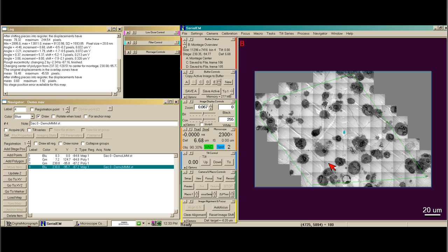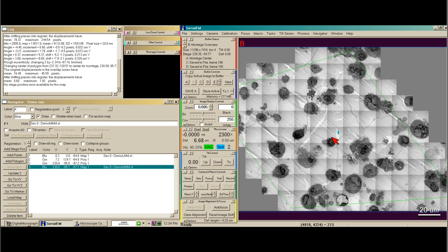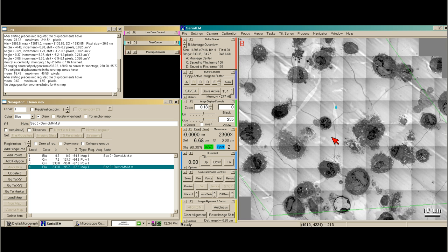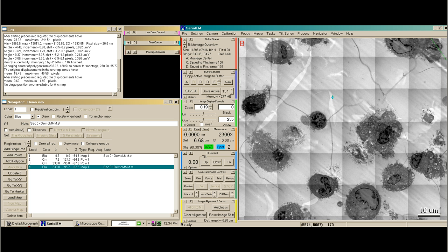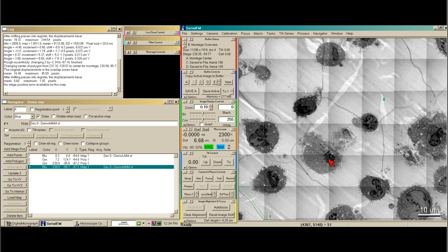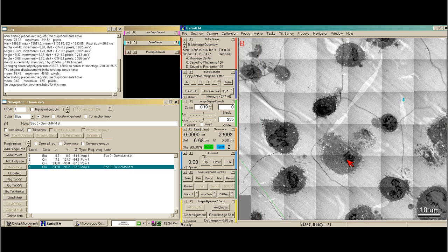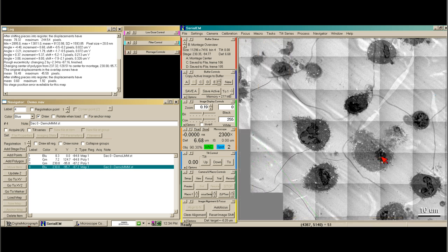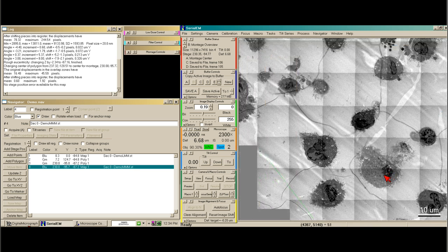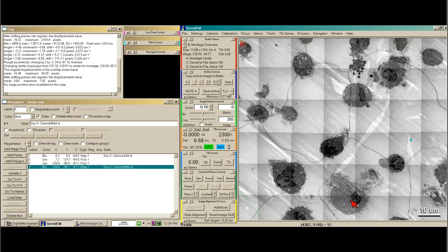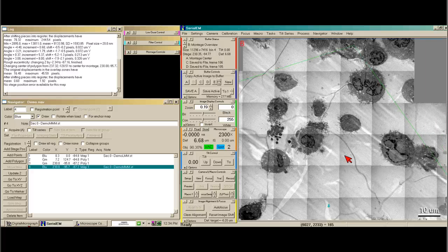We are going to auto-acquire some points. Using the plus key on my keyboard, I'm going to zoom into the map and look for areas of interest. By left-clicking and holding down, I can drag the map to wherever I want at this higher zoom.